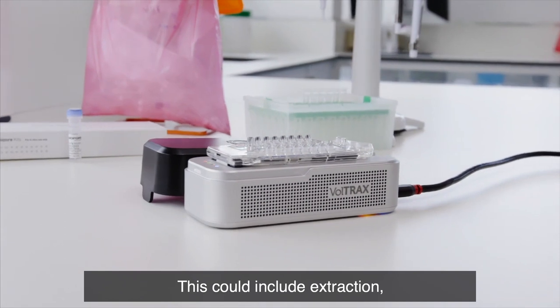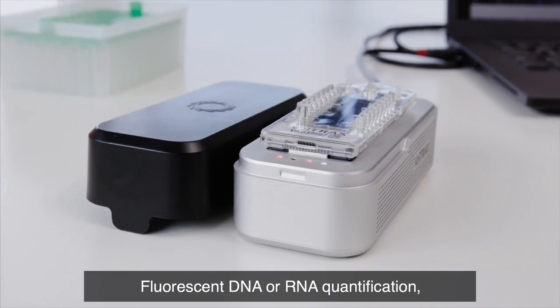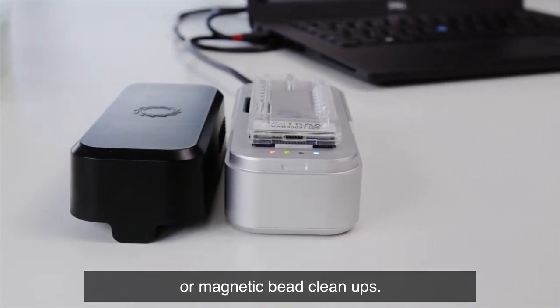This could include extraction, reverse transcription, amplification, fluorescent DNA or RNA quantification, or magnetic bead cleanups.